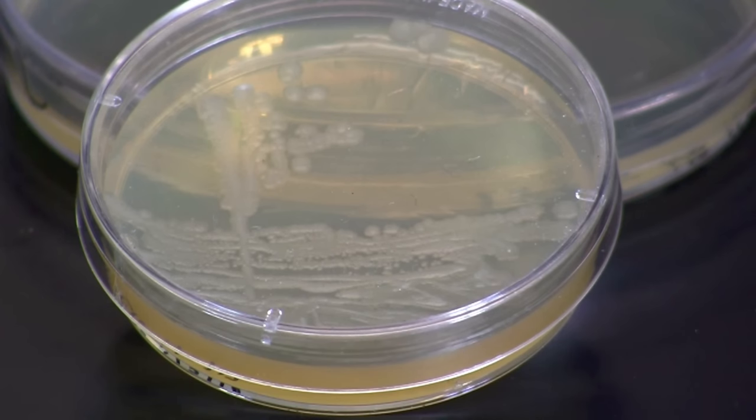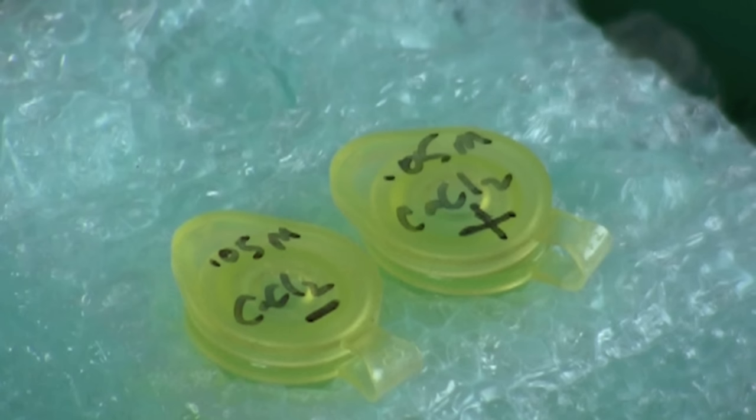To start this activity, you will need an LB agar starter plate, streaked for single colonies of E. coli HB101, and two microcentrifuge tubes, each with 250 microliters of 0.05 molar calcium chloride or transformation solution. One of the tubes should be labeled plus and the other minus. Both tubes should be kept on ice.